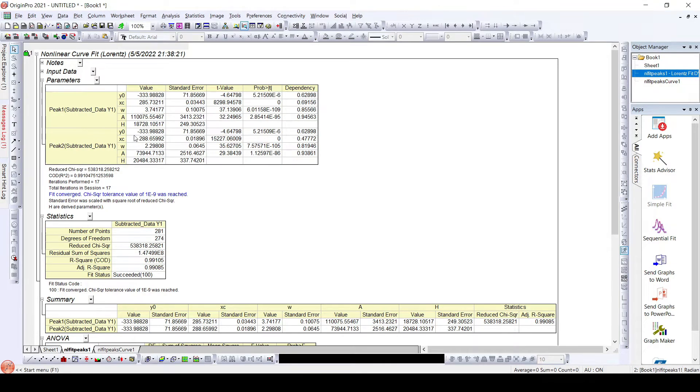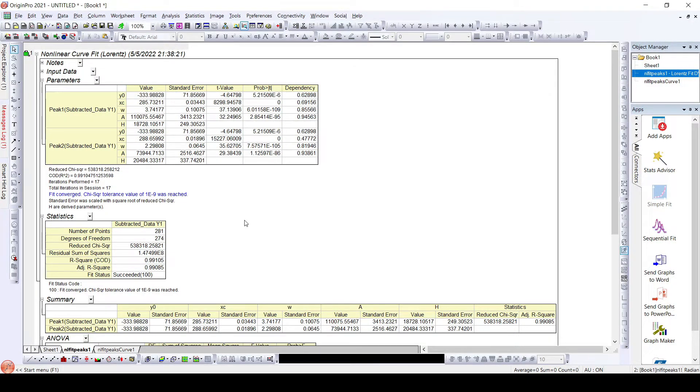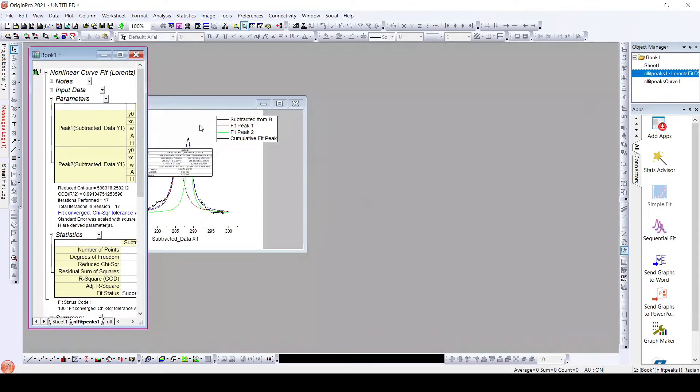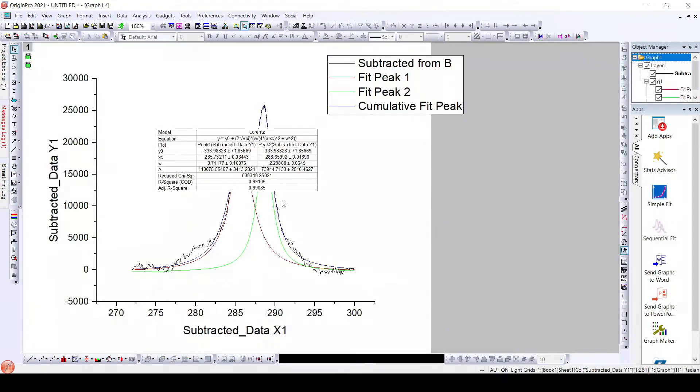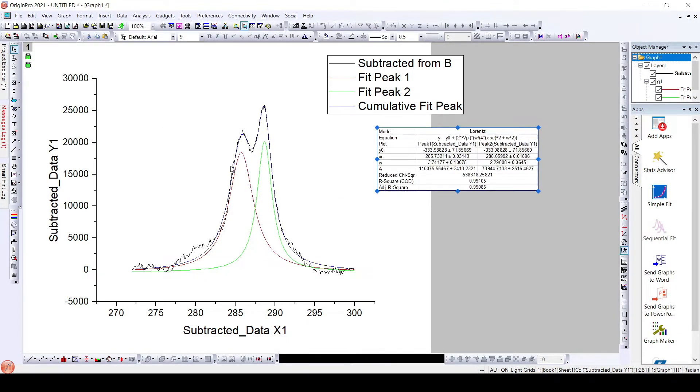Here we have all the peak data after fitting the peaks: Peak 1 and Peak 2. The properties of the peaks can be seen here, and we can see the well-fitted data.